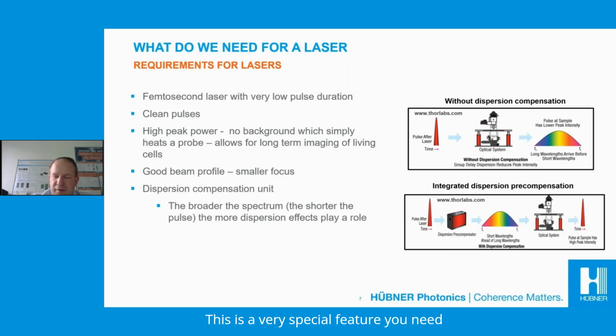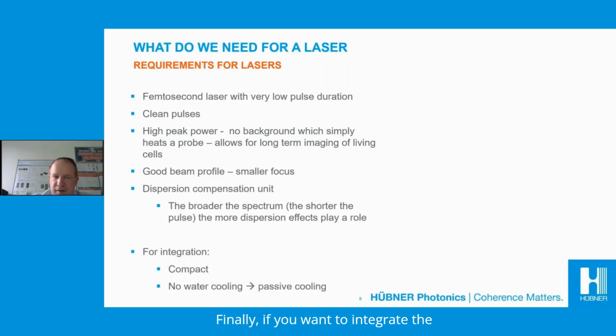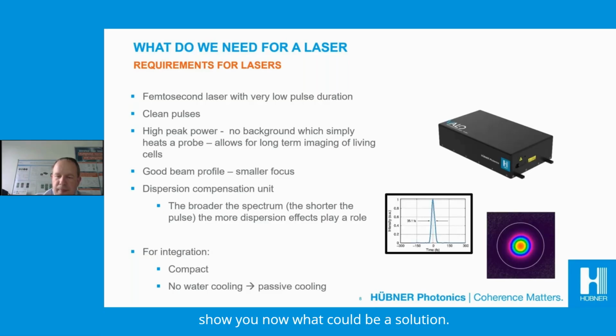This is a very special feature you need to have for really short pulse duration, because there, as I said, the dispersion plays a major role. Finally, if you want to integrate a laser in some kind of setup, you need to have a compact version, and you also want to have no water cooling. You want to have a passive cool system. And I will show you now what could be a solution.